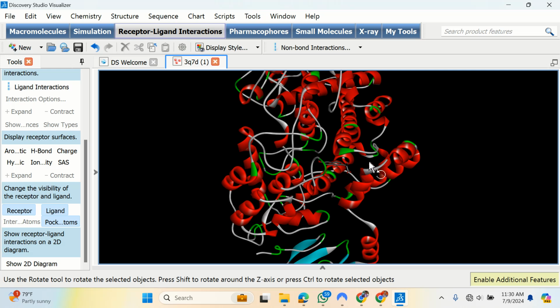I've shown us how to download it before. So I'll simply save from here and work with this as my external library. I will save my protein and this ligand individually.